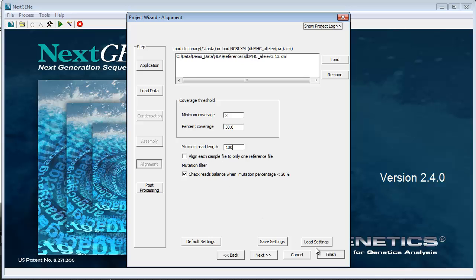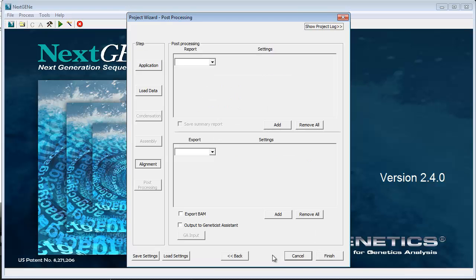You can click finish here or click next to proceed to the post processing step to automatically export the HLA report following the analysis. If this step is not included, the HLA report can still be exported manually from the viewer.